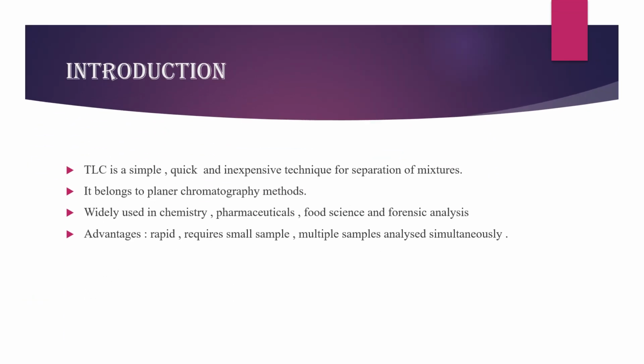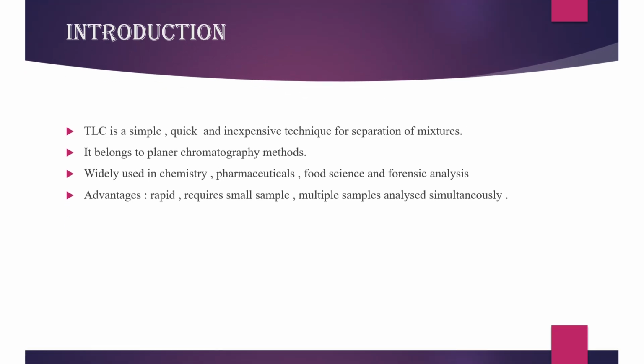TLC is a simple, quick, and inexpensive technique used for separating different components of a mixture. It belongs to the planar chromatography method. This technique is widely used in chemistry, pharmaceuticals, food science, and also in forensic analysis. The major advantages of TLC are that it is fast, requires only a small amount of sample, and allows multiple samples to be analyzed at the same time.